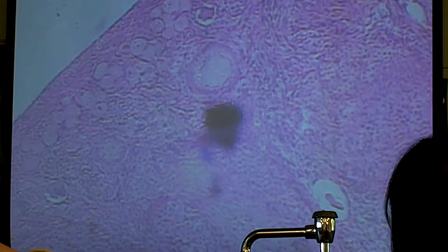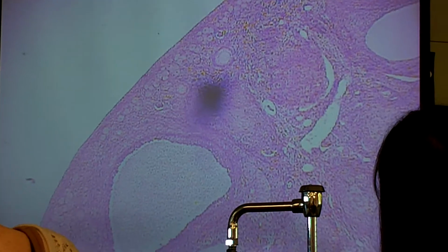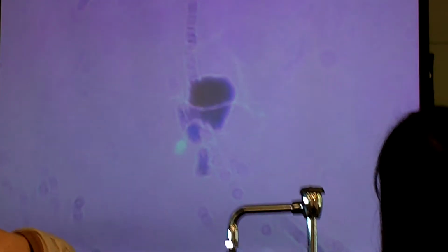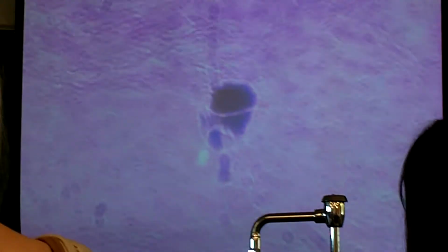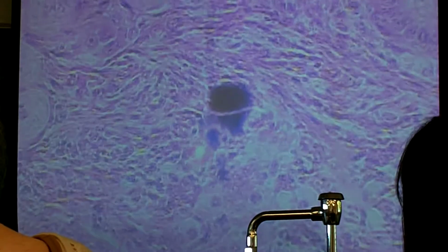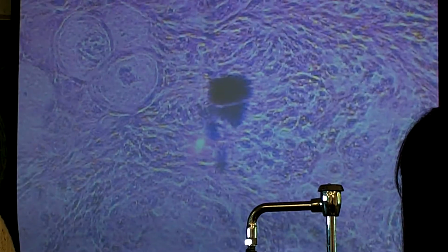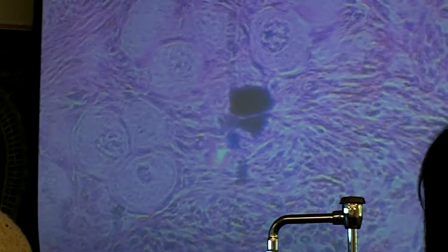We can go a little bit closer even. Closer. There we go. So here's what some primordial follicles look like.